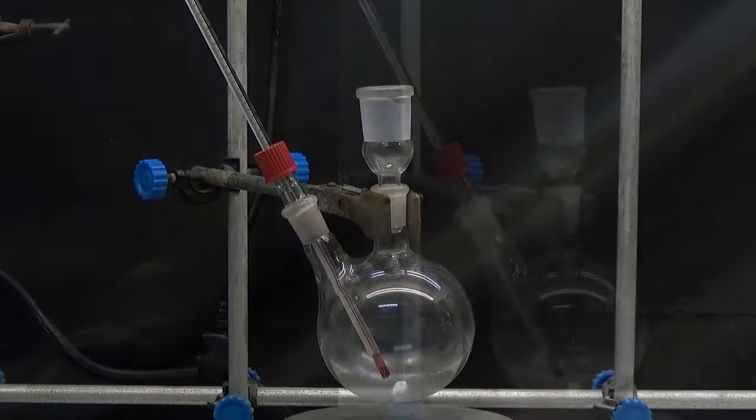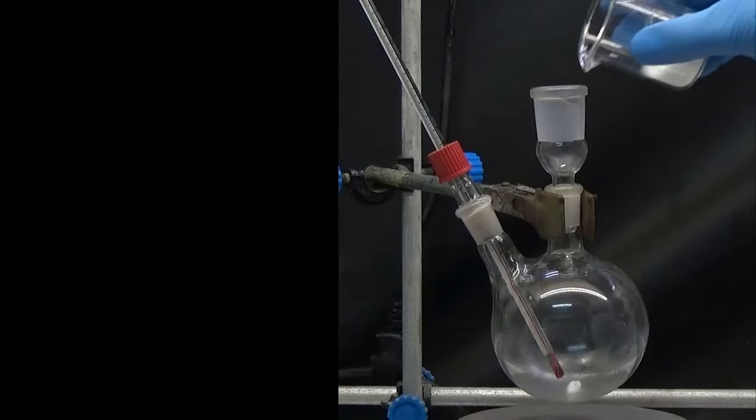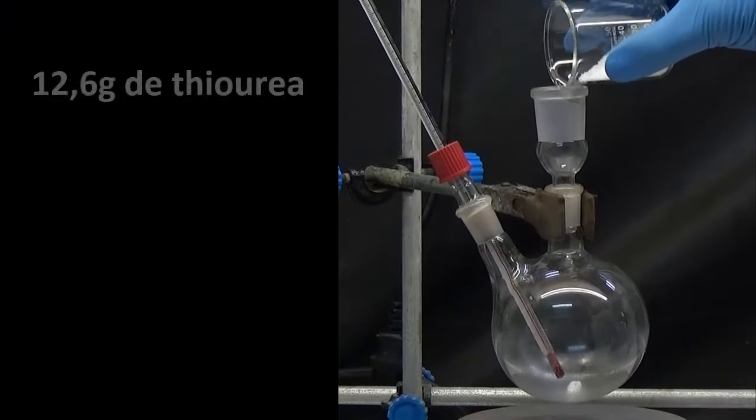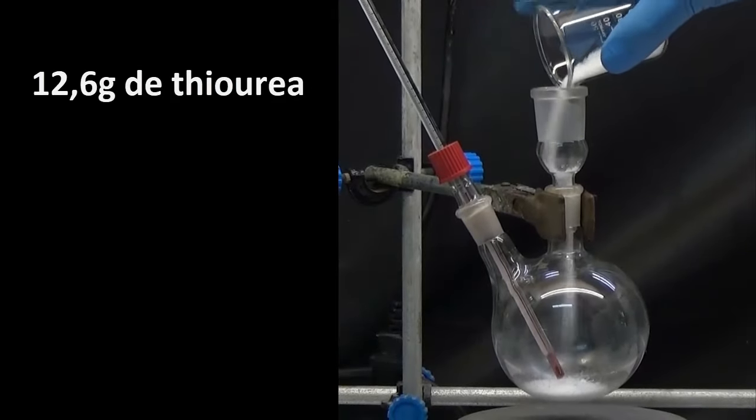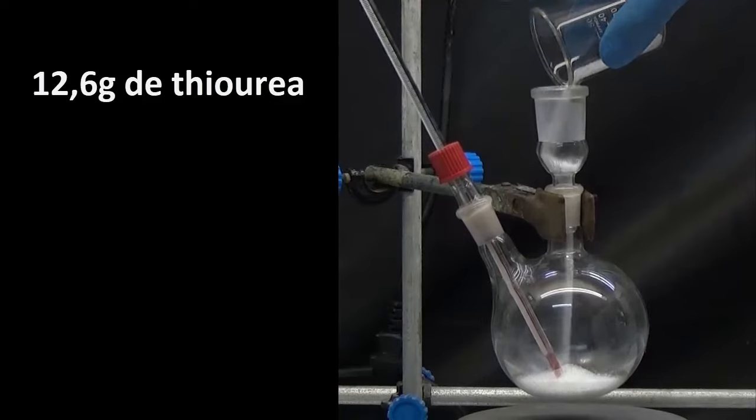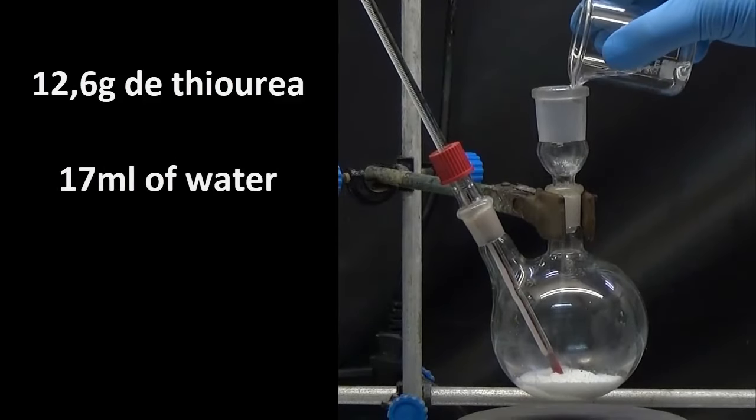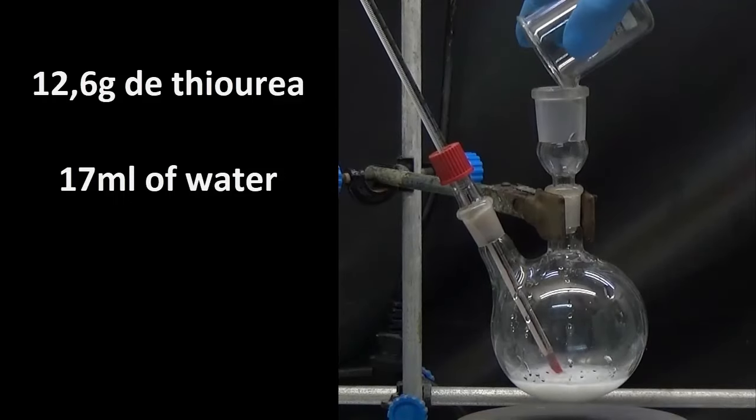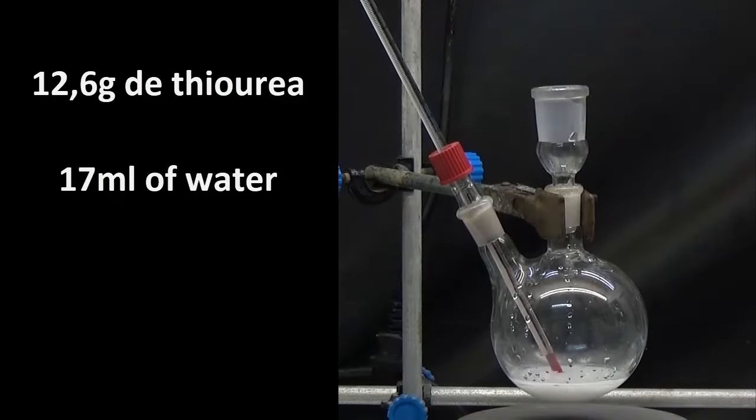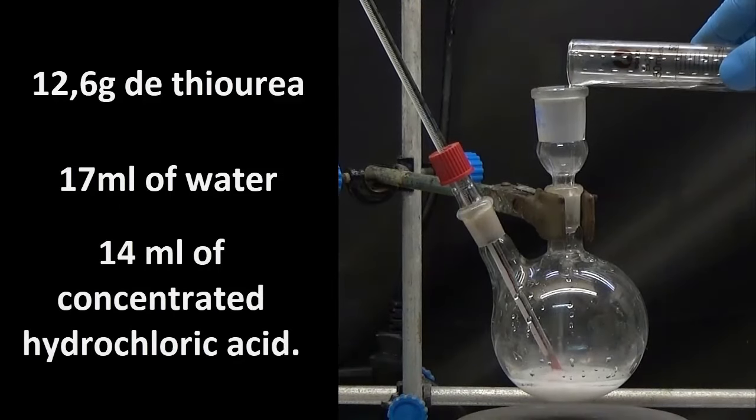In a 250 milliliter flask with a thermometer, we place 12.6 grams of thiourea, 17 milliliters of water, and 14 milliliters of concentrated hydrochloric acid.